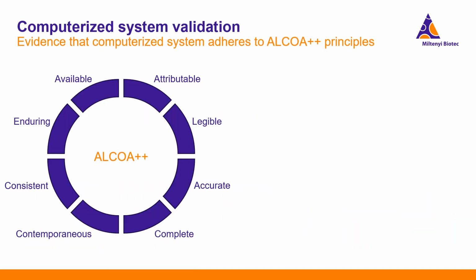Cell therapy manufacturers that must conduct any work in centralized GMP facilities or decentralized point-of-care sites have to ensure that instruments utilized in the process have onboard technical solutions following ALCOA principles. ALCOA principles are put in place to ensure, for example, that data and electronic records are accurate, complete, and consistent. If these technical solutions are not provided by the instrument vendor, it is required for the manufacturer to introduce such measures manually. Not having such tools on board by design delays patient treatment and increases costs by increasing time to market release of the cell therapy product.